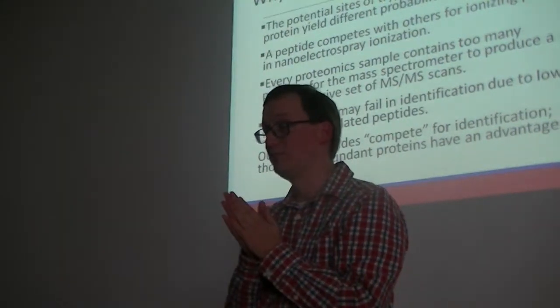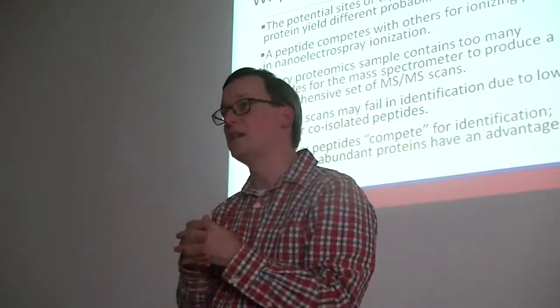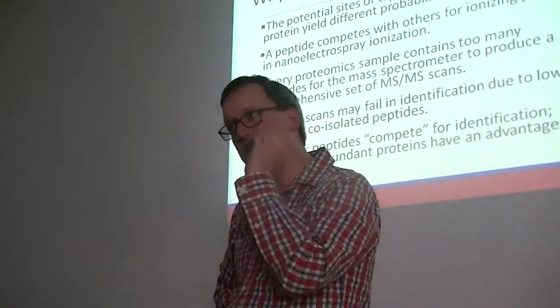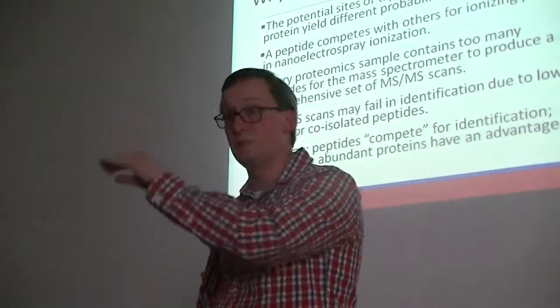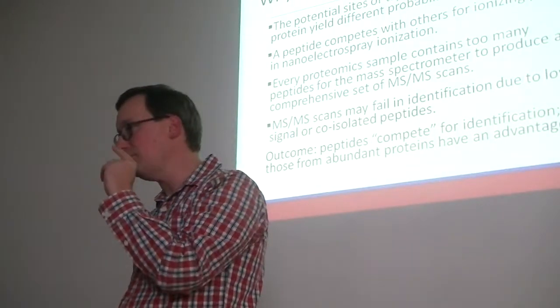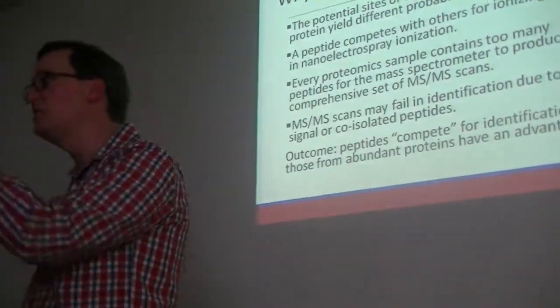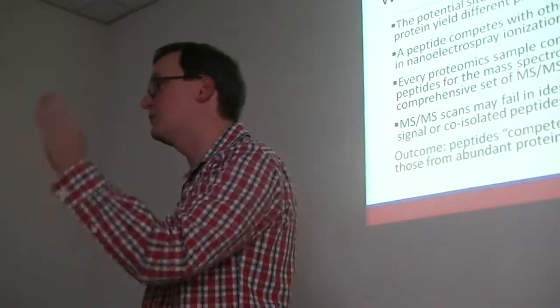the mass spectrometer. Think of what happens when you have a sample of high complexity, like a piece of meat out of somebody's colon or arm or whatever, right? When you have a sample of that high a complexity, the number of possible peptides that could potentially be identified is astronomical. And you may run the sample once, twice, 10 times, 20 times, and still be seeing new peptides that you didn't see the first time you ran them, or the second time, or the third time.